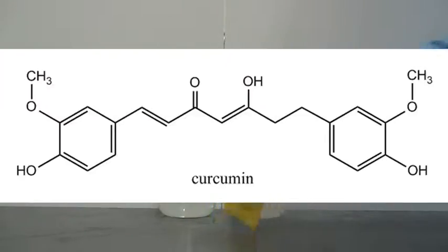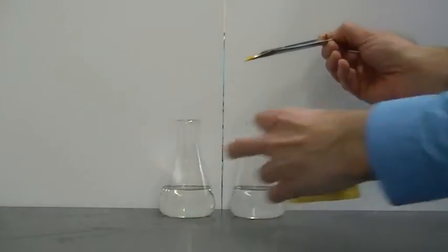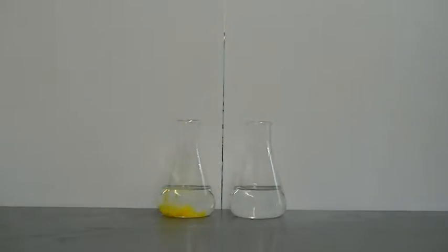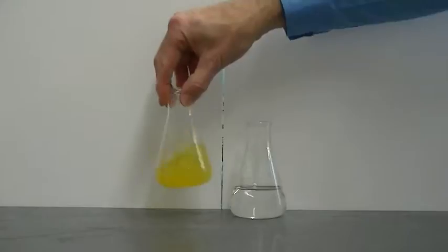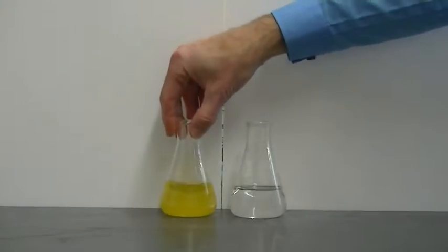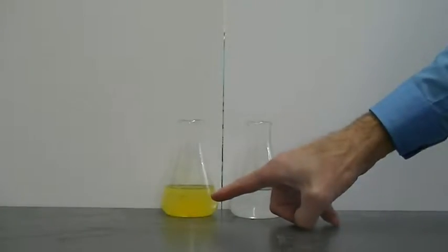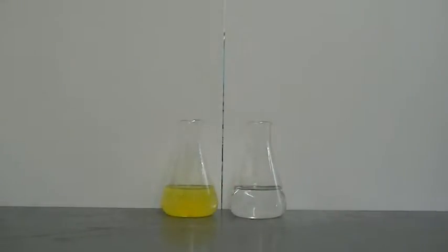Curcumin is a nonpolar compound, and so we would expect curcumin to dissolve fairly well in a nonpolar solvent such as this acetone in this flask. I add the sunflower dye to the acetone and give it a swirl, and I see that indeed the sunflower dye dissolves very well in the acetone. That's probably from the curcumin.